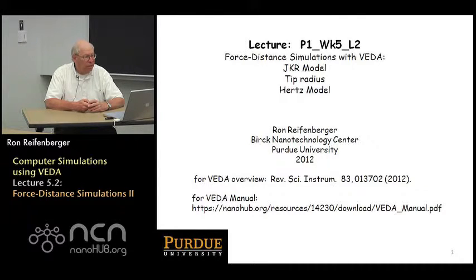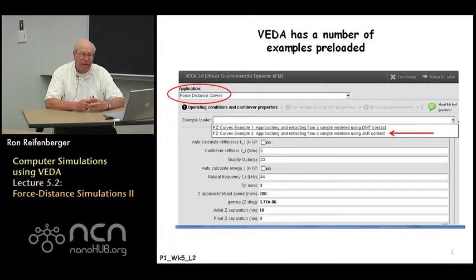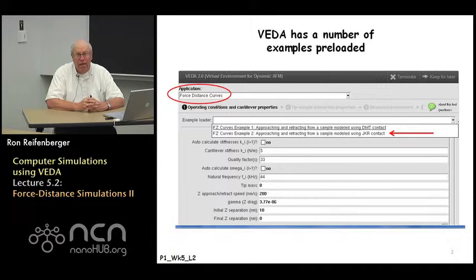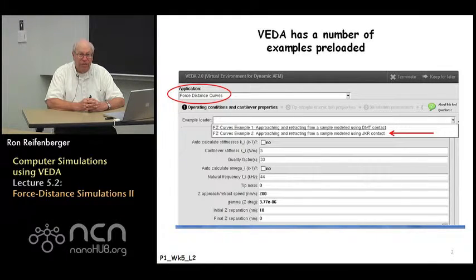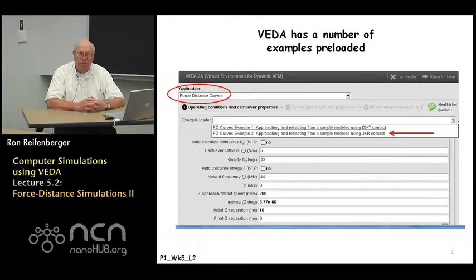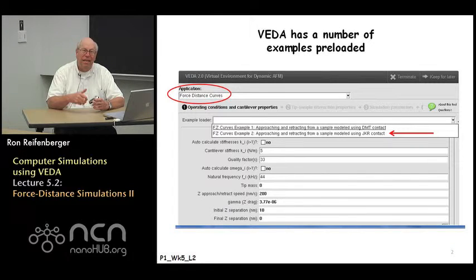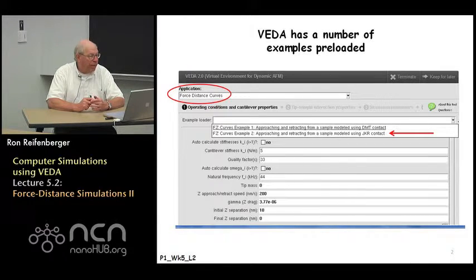Let's do the first example: the JKR model. VEDA has a number of preloaded examples where all the parameters are basically set. If you select these preloaded examples the simulations are guaranteed to work, and you can test your understanding by trying to interpret what you see on the simulation screen — you're not guessing at input parameters. To demonstrate this, select under application the force distance curve.